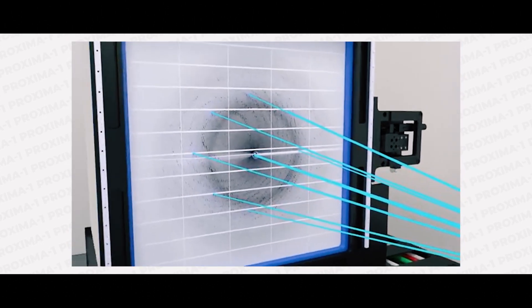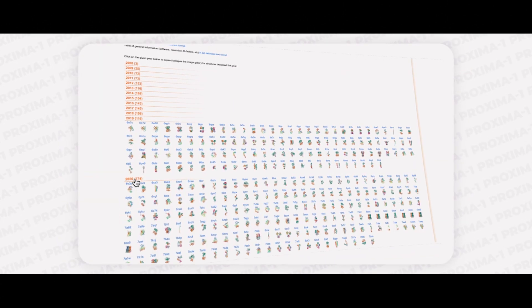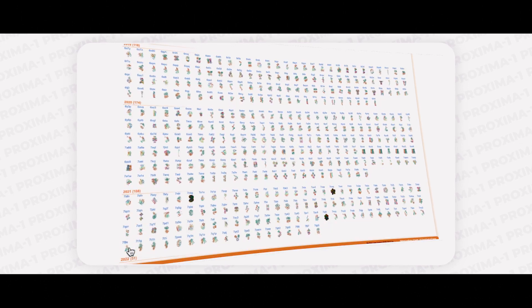The beamline is available to academic and industrial users since 2008, during which time over 1,600 protein structures have been resolved.